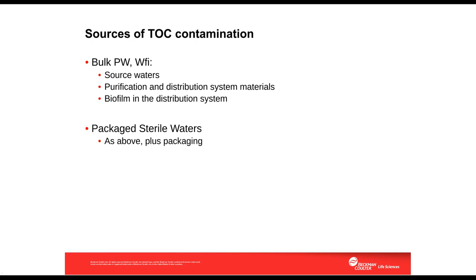Now, total organic carbon is one of the four critical quality parameters defined by the Pharmacopoeias for bulk purified water, water for injection, water hemodialysis, and pure steam condensate, plus, of course, packaged sterile waters. The other three are conductivity, microbial colony forming units, and endotoxins.